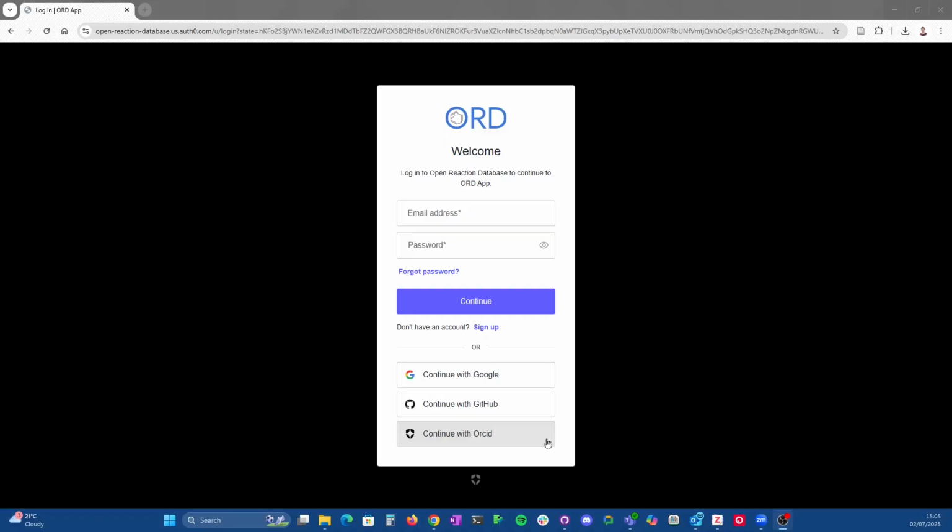The software, as it's currently set up, we don't have any way to link multiple accounts together for users, and we have encountered some bugs where if you create multiple accounts, you can create clashes with emails and ORD references and things like that. So stick to one account. Pick the one that works best for you.